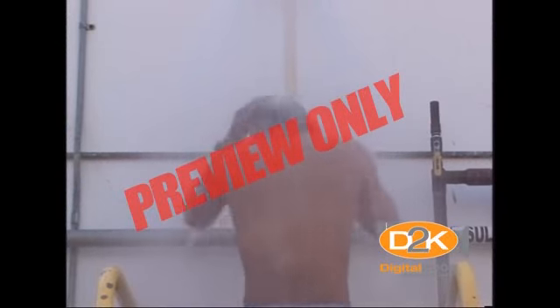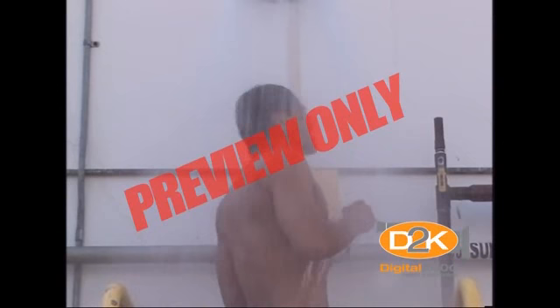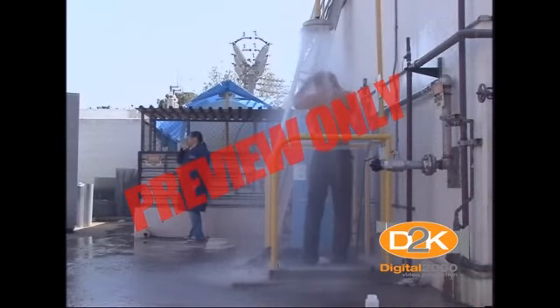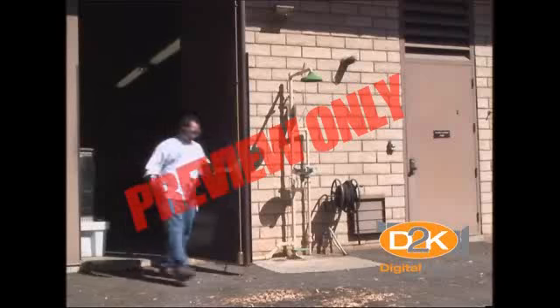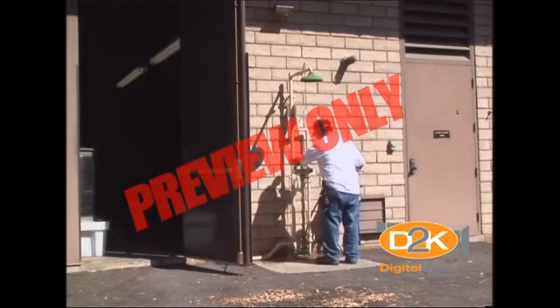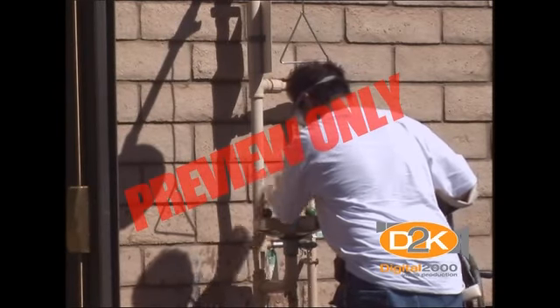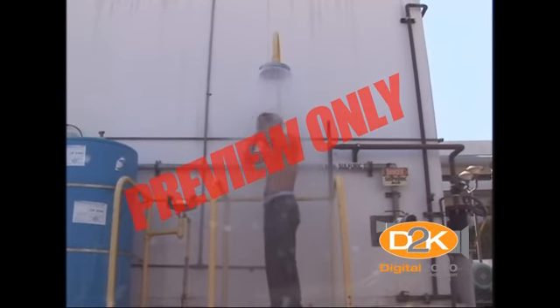An emergency shower and eye wash station must be available within a 10-second walk from each area where hazardous substances are used. Further, the emergency shower must be clearly labeled and easily accessible. In the event of chemical exposure to skin, you should immediately flush exposed skin with cold water for a minimum of 15 minutes, making sure to remove any jewelry or clothing that has become contaminated. If the exposure occurs to the body, then you must use the emergency shower for a minimum of 15 minutes.